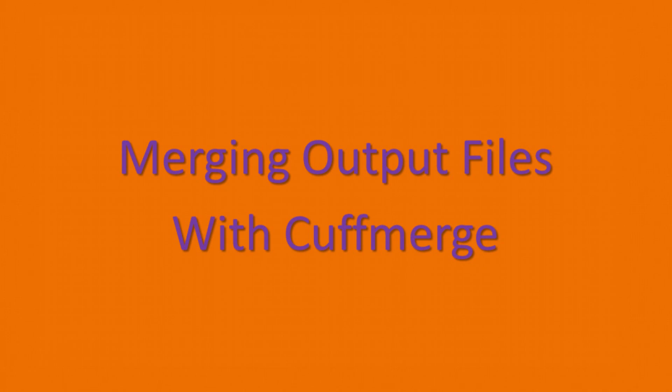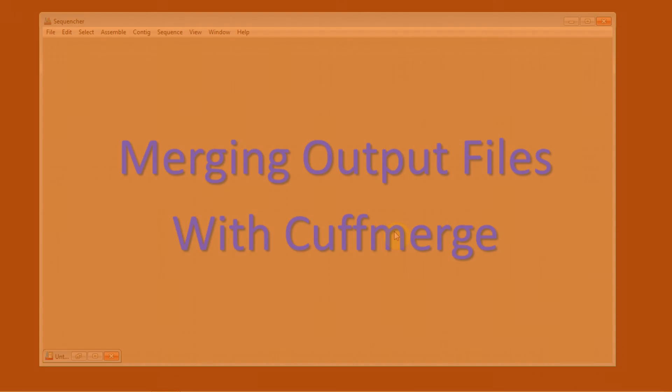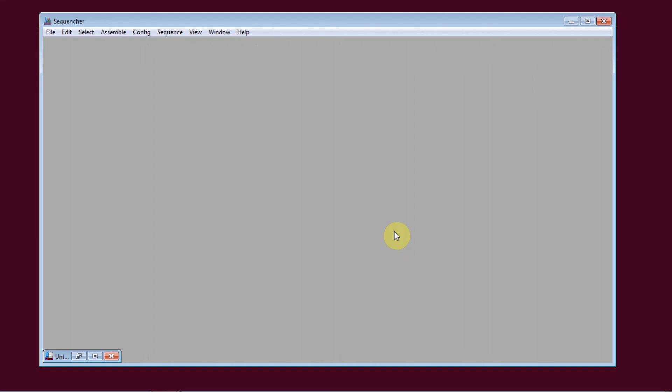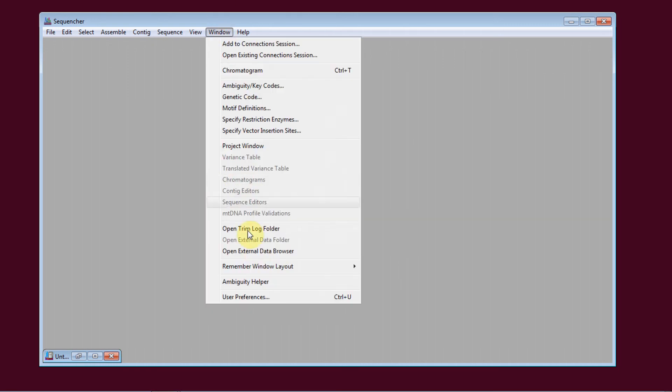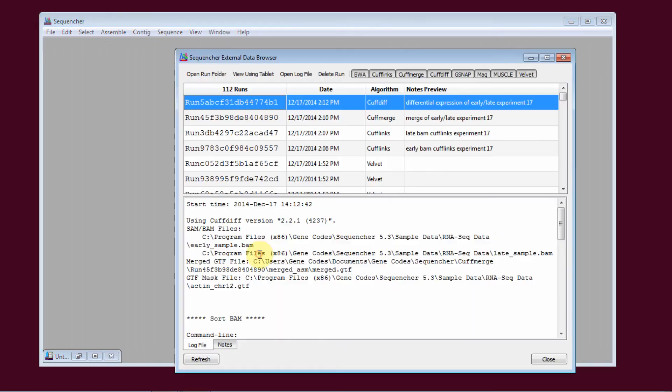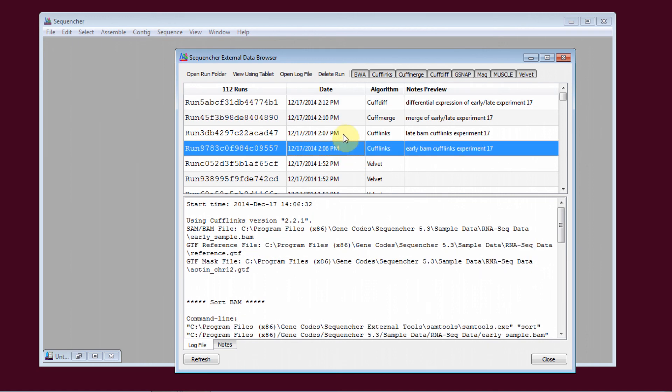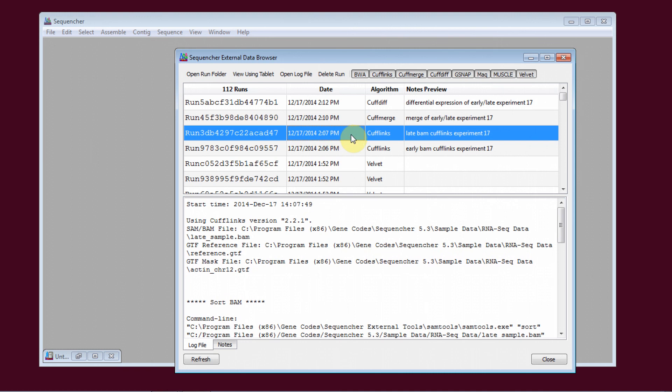The second step is merging the output files with CuffMerge. I'm going to open the external data browser, which we can use to track our progress throughout the process. You can see the two CuffLinks runs I did here. I've added notes telling me that these are the early reads and the late reads from Experiment 17.